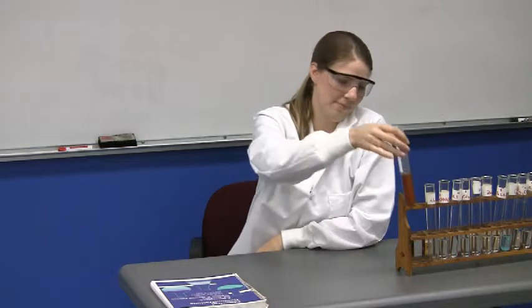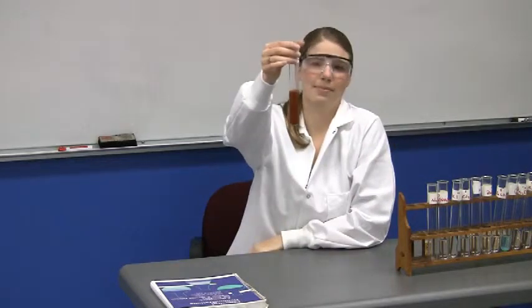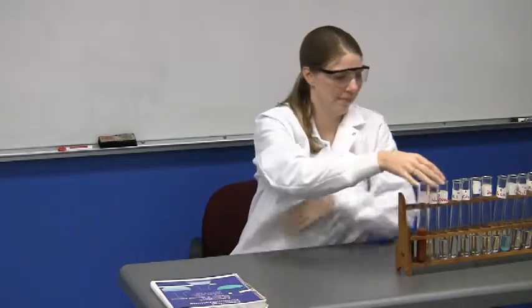So Jennifer just combined HgCl2 and Na2CO3, and when the students complete the equation, they write aq after the appropriate formula of the compound, and they write s after the compound that forms a precipitate. Now, how do they know what compound that is? They use the solubility rules from the textbook. Okay, so that was kind of a brown precipitate, right? Yes. Okay, very good.